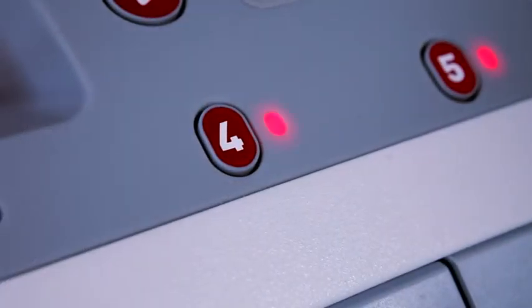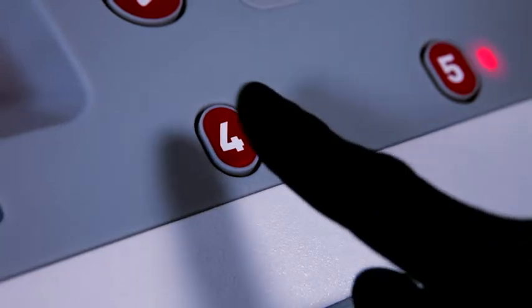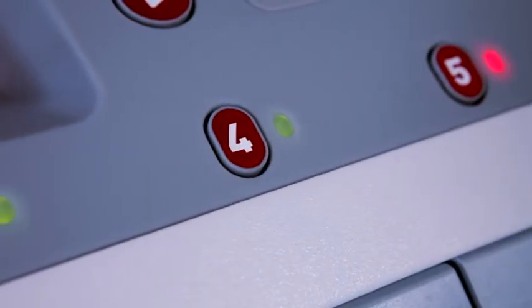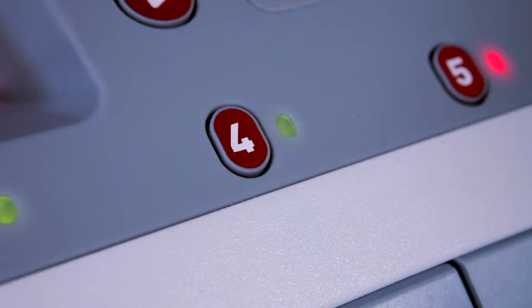When the elution cycle is done, the light will alternate between green and red. This is your cue to start the drain cycle by pressing the number button once again.